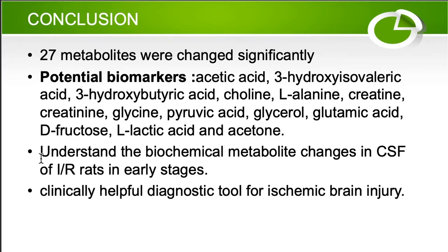The NMR method helps us to understand the biochemical metabolite changes in the CSF of ischemic stroke and reperfusion rats in the early stage, and metabolomics may have the potential to become a clinically helpful diagnostic tool for ischemic brain injury in the future.